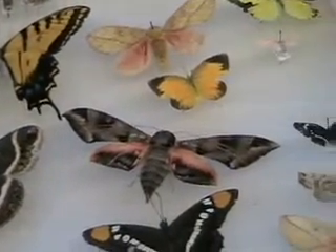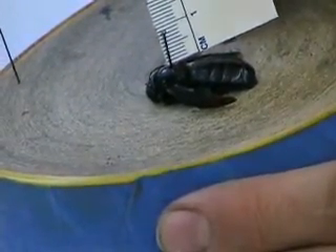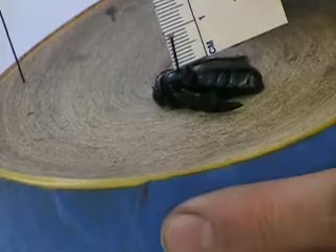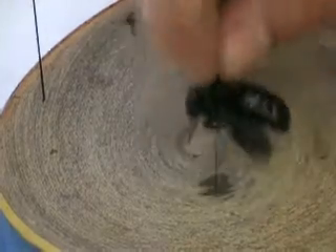One common problem with pinning insects is how high you put the specimen on the pin. As a rule of thumb, you always want to pin the specimen so you have at least 10 millimeters from the specimen to the top of the pin.